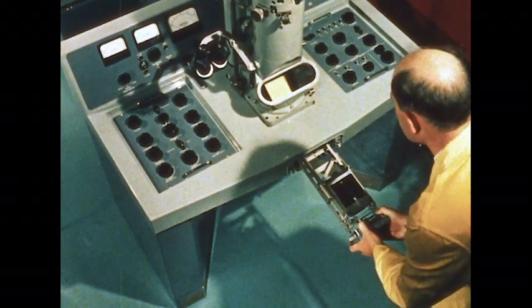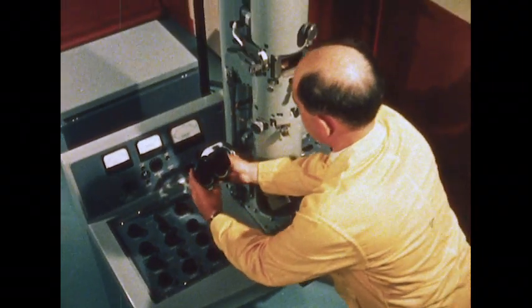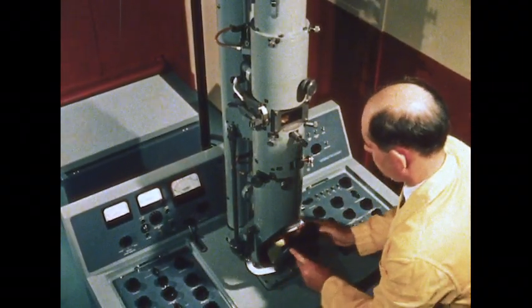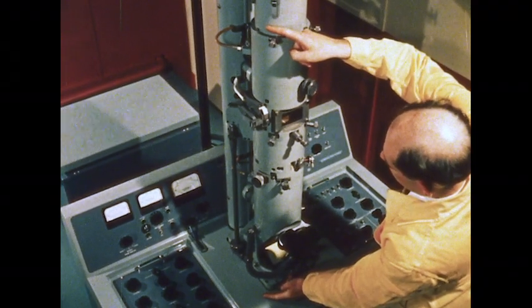The electrons cannot penetrate more than 1 millimeter in air, but in the microscope they must travel from the electron gun to the viewing screen. They can cover this distance only in a very high vacuum.